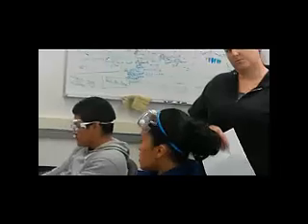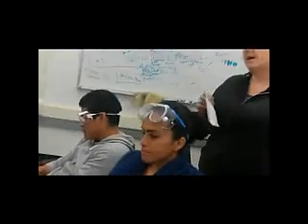And then the next person, whenever they want to come on, will do exactly the same thing. They will load up their method and a sequence, which we'll tell them where we'll be at. They do the sequencing and take their sample. Here, we're doing it all in one swoop. So when you're ready to come back in, whatever time it is, like Rebecca, you come back tomorrow or on Tuesday to pick up the data. You're done. You don't have to wait.